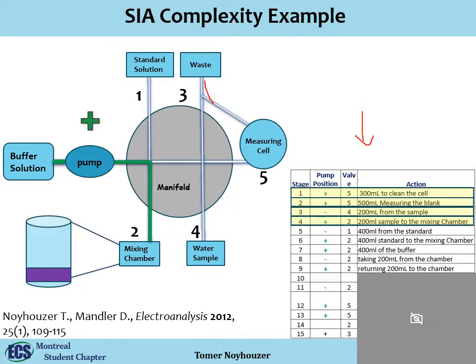You use water. You have something that you're told the weight of, so that is zero, and then you add the liquid into it, and then you weigh it. And you also need to make sure that when it draws liquid from that cup, it also draws the amount that you told it, and if not, you need to adjust your software. So let's go back to this example.